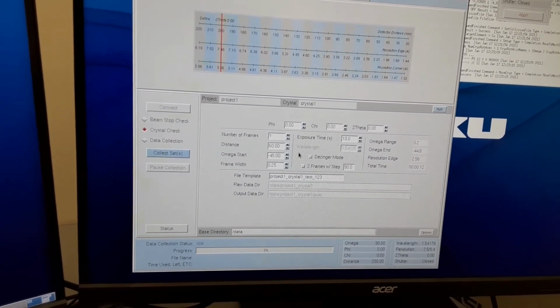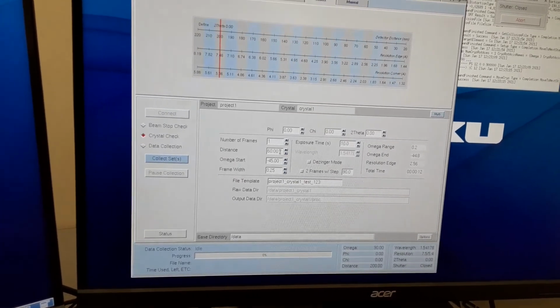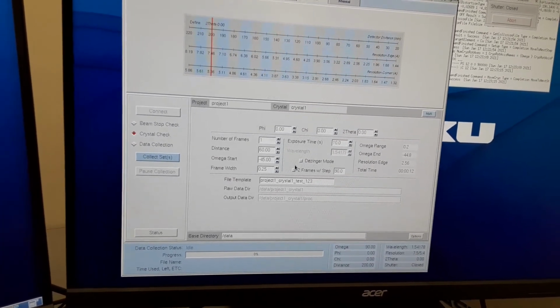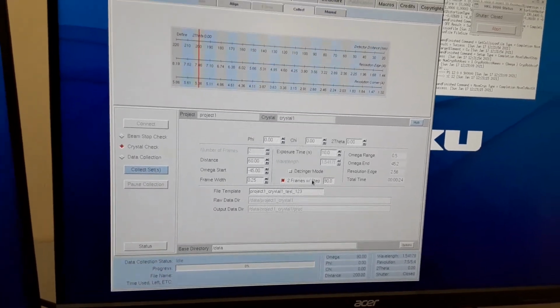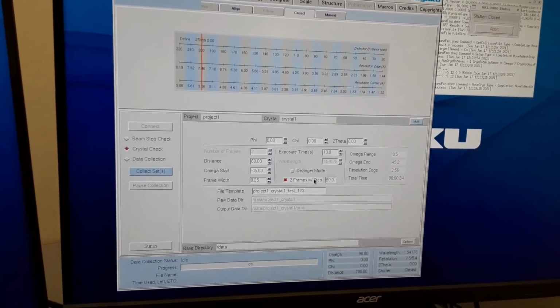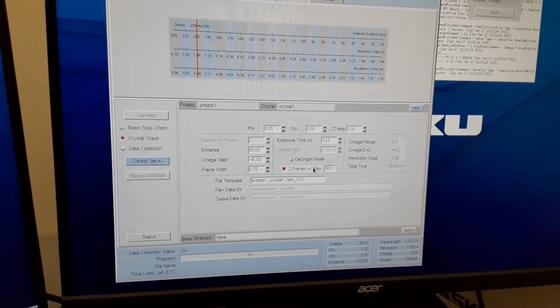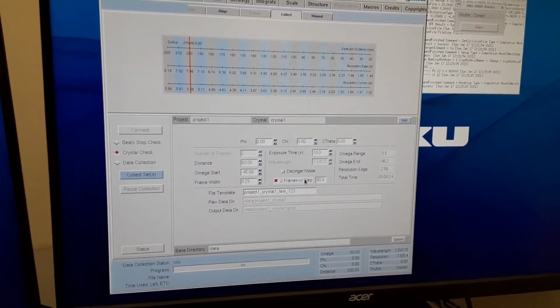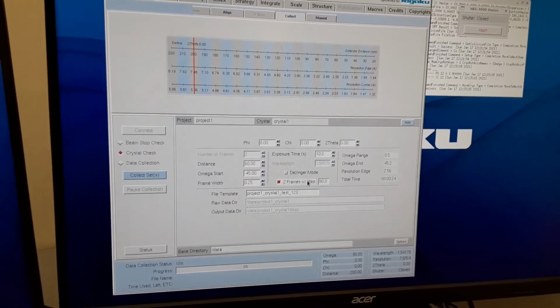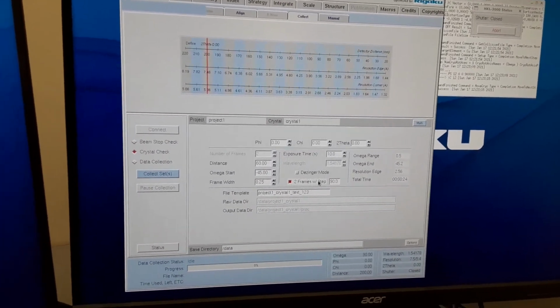What most folks do is they set a short exposure time of about 10 seconds at the default distance. And we also do 2 frames with step 90 degrees. That allows us to get a shot of the crystal in one direction, rotate the crystal 90 degrees, and shoot it again in the other direction. This will ensure that if it diffracts well in one direction, it also diffracts well in the other direction. And that'll be a quality crystal.